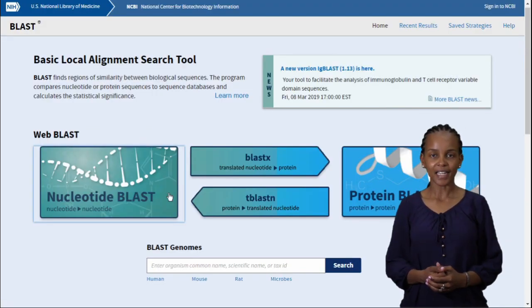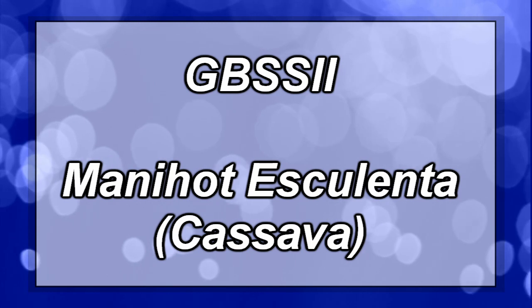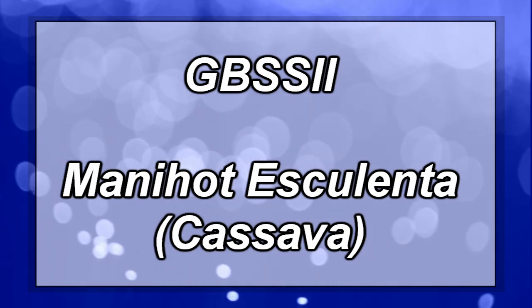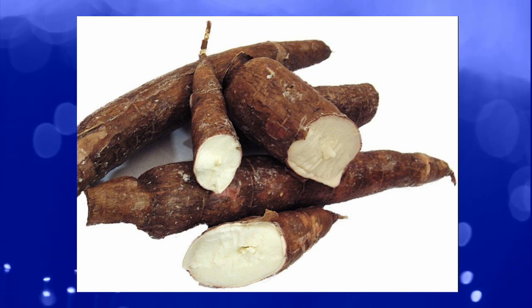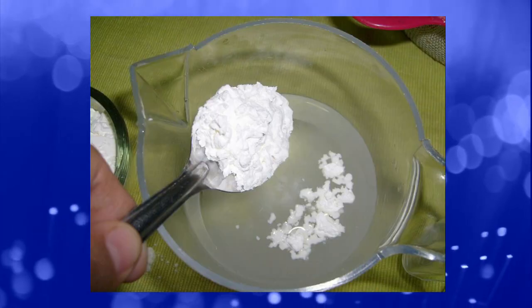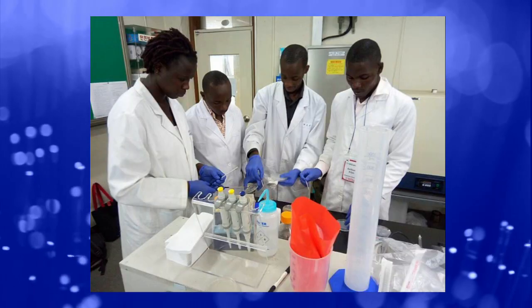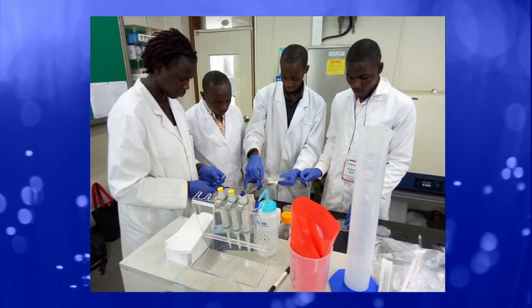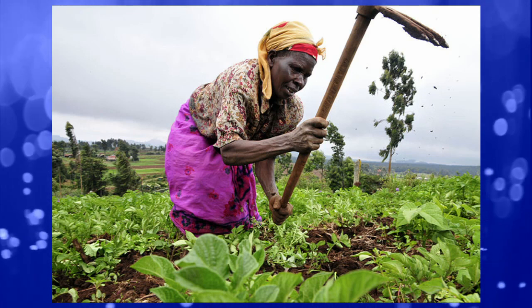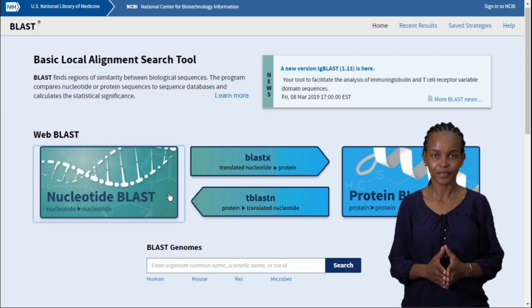We want to align a gene called GBSS2. This is from Manihot esculenta, the Latin scientific name for cassava. This gene codes for starch synthesis enzyme. This could be an interesting gene for scientists to work with. We can use it to improve the nutrient profile of the cassava.